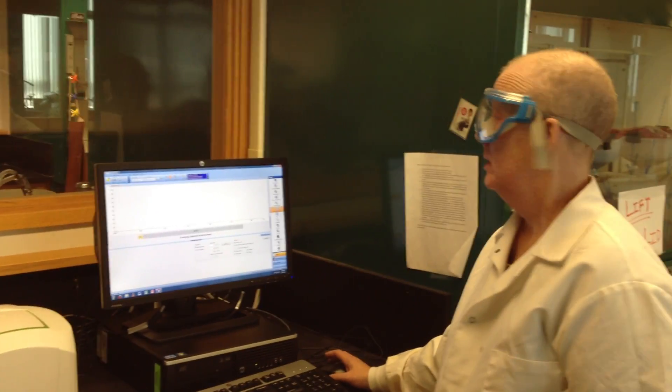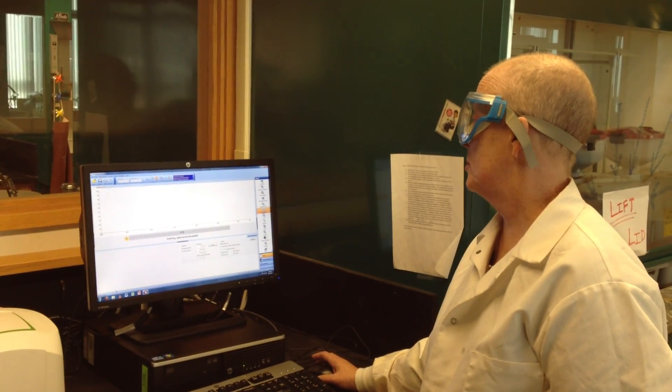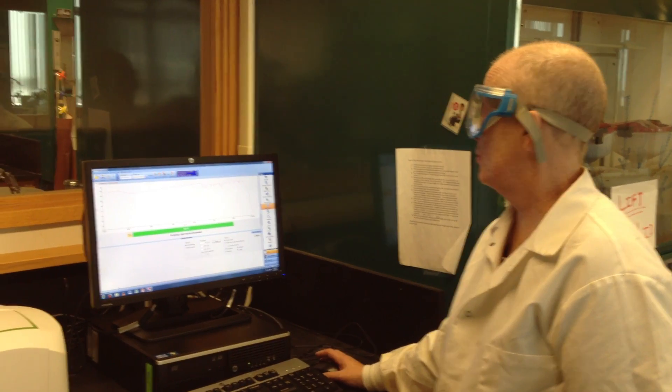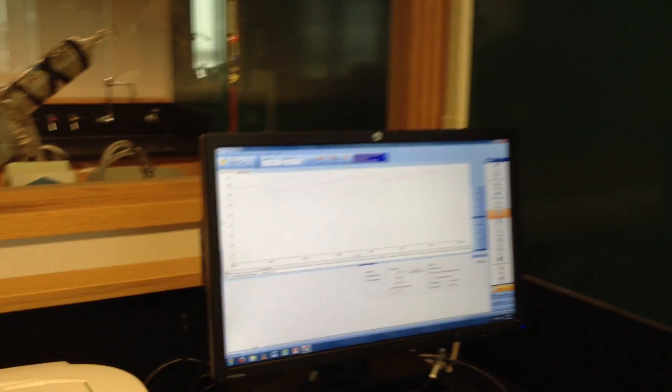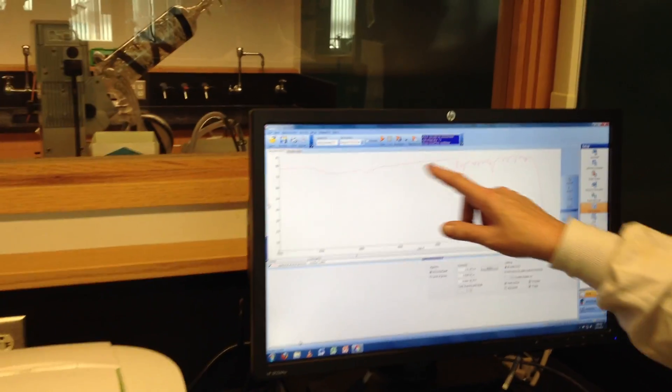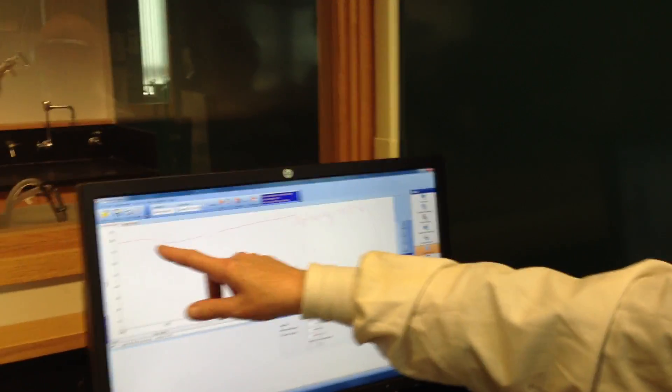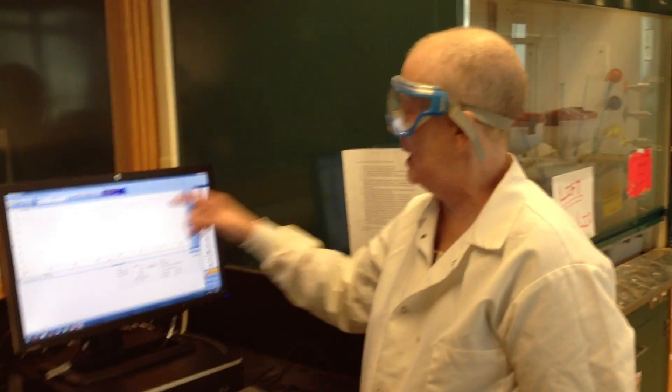Let's see how this comes out. This may be a disaster, because I'm running a crude product here. So it just ran. This doesn't look too bad. It's not a disaster. It's kind of what I would call a weak-looking spectrum. You can see it's rather weak. So I'm going to show you how I manipulate it a little bit. You can see kind of this pink line.